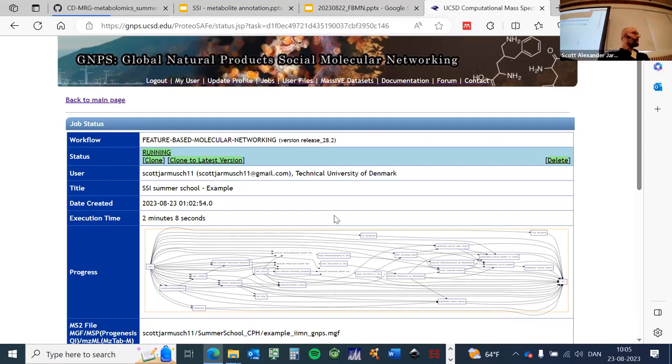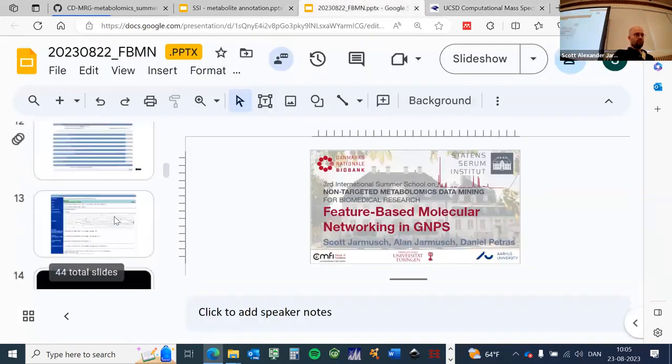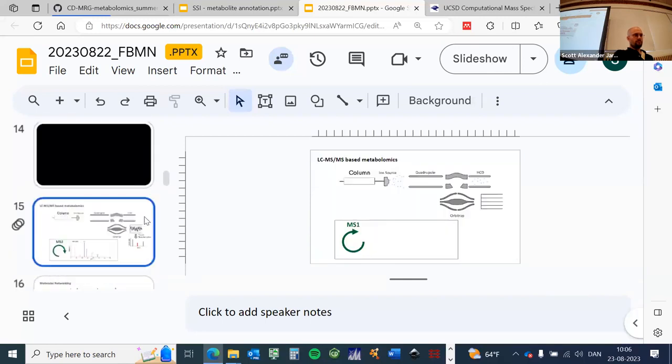So in general, I would recommend to upload your MZML files, because then you can directly visualize them in the dashboard afterwards. We're not going too much into detail with that, but it's a good way to link the MZML files, your raw spectra information, to your job. I may show you later what you can do with it, but it gives you the power to go directly back to the raw data and inspect it, which comes in very handy at the validation stage.